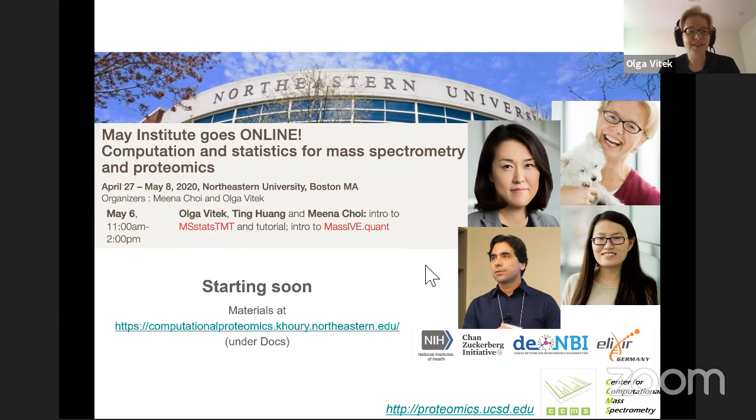And also Nuno is the person behind MassIVE. So this is one of the repositories for storing and analyzing mass spectrometry data. And so I'm very excited to hear Nuno's presentation today about MassIVE.quant, so how MassIVE is extended for quantitative experiments. So thank you very much, Nuno, and welcome to May Institute.